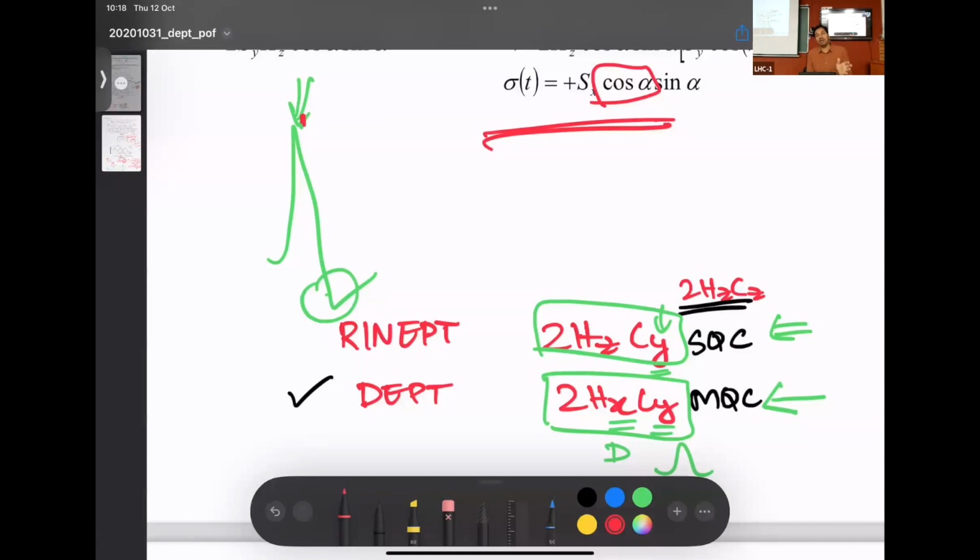Right? So therefore, we are rather okay taking a hit on line broadening. Since you anyway have the natural line width quite sharp for small molecules, you are ready to take that hit. Right? What is the next question you are about to ask?